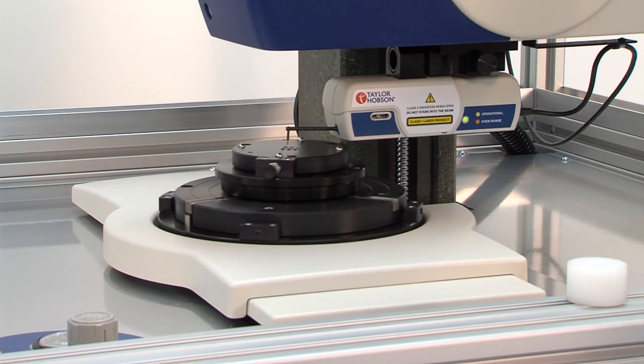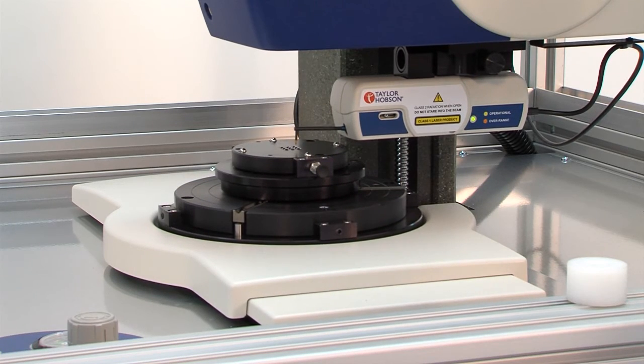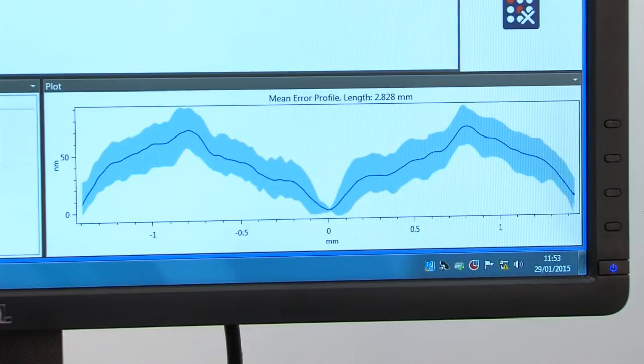Unique patented technology delivers nanometre level residual form error analysis across batches with instant and clear feedback.